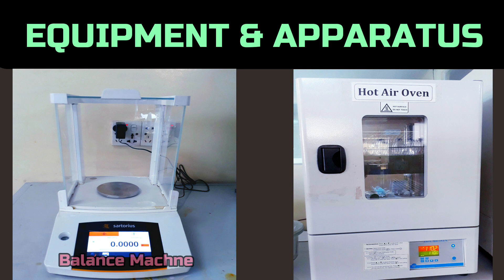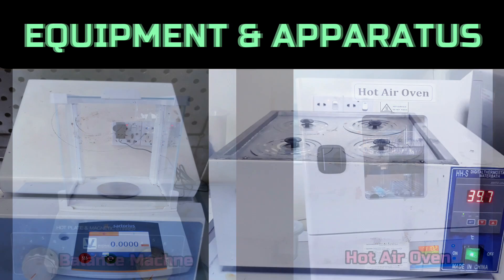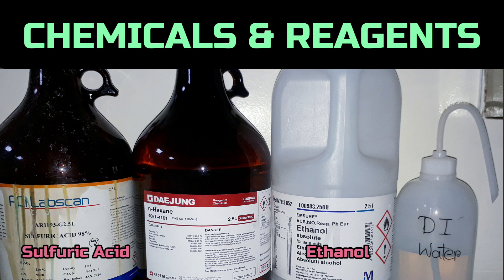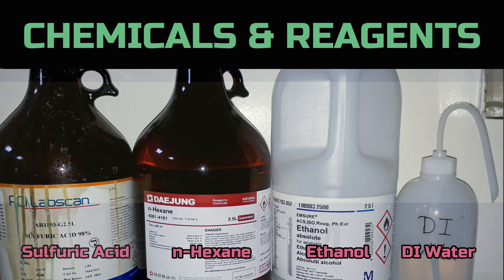To conduct the test, we need a balance, hot air oven, hot plate, water bath, pycnometer, pipette with filler, sulfuric acid, ethanol, N-hexane, and deionized water.